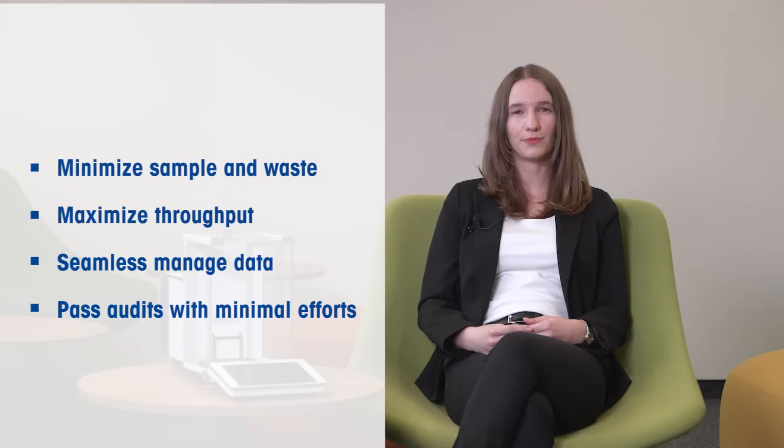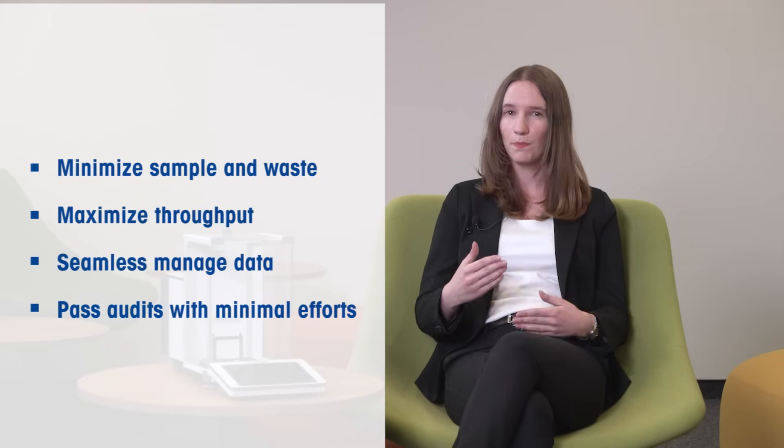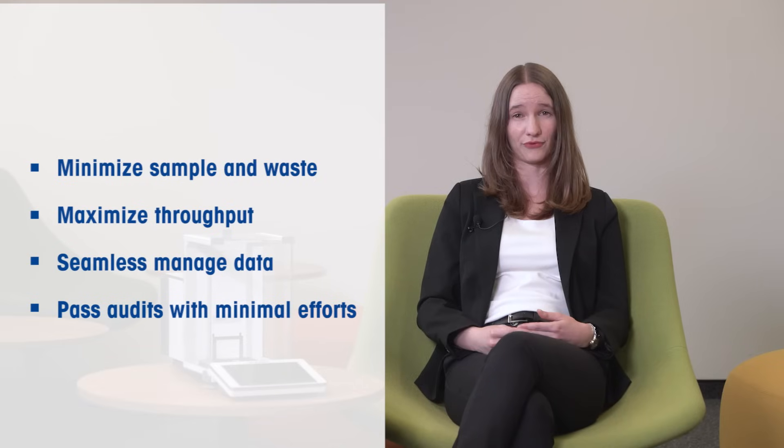Let's recap. All these advantages make the XPR Analytical Balance an awe-inspiring and unique instrument. Its exclusive features support you to minimize your sample size and waste while maximizing your throughput. It helps you to seamlessly manage your data, making it easy for you to pass audits with minimal effort.